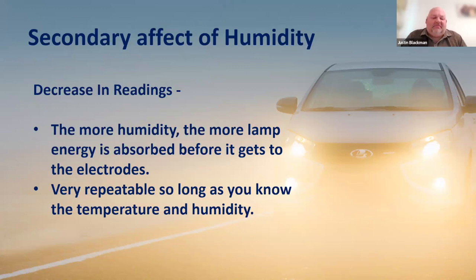This effect is so repeatable, in fact highly repeatable. So long as we know the temperature and the humidity, this drop in signal will be the same percentage every single time for a particular manufacturer of instrument.